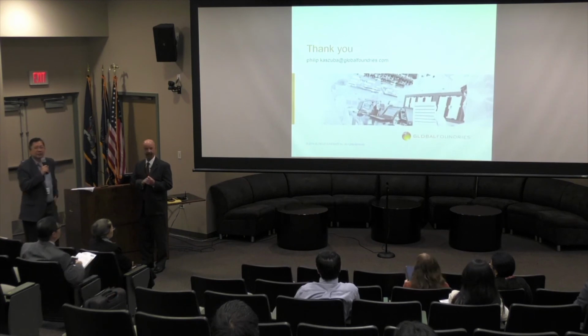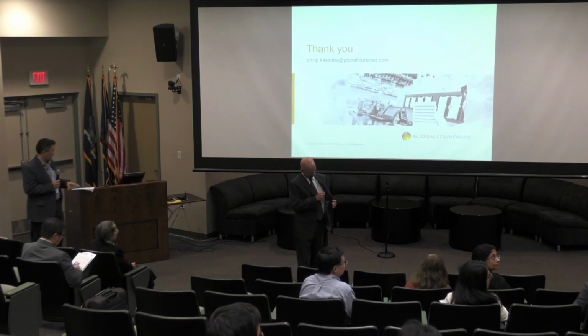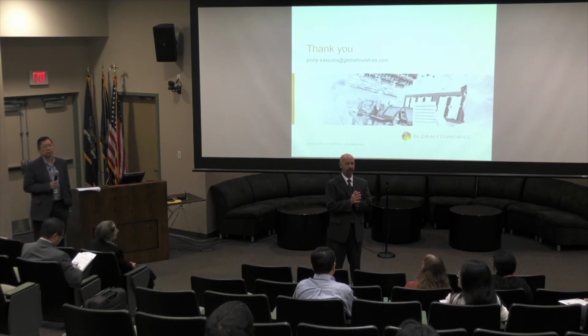Alan? Very nice talk. Thank you. So you prefer scanning capacitance to SSRM. What's your rationale for that?